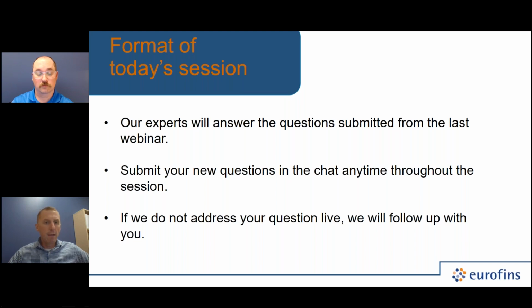So the first one is, can you use flow cytometry for yeast enumeration? And can you differentiate yeast from regular bacteria when using flow cytometry? Short answer is yes.